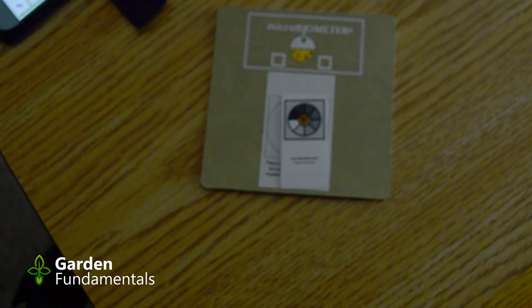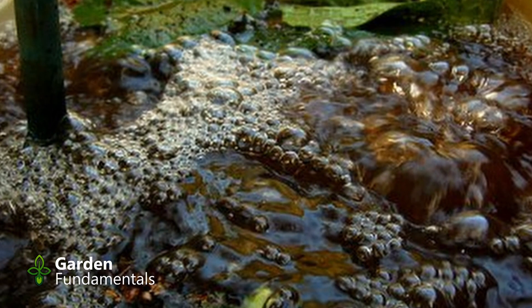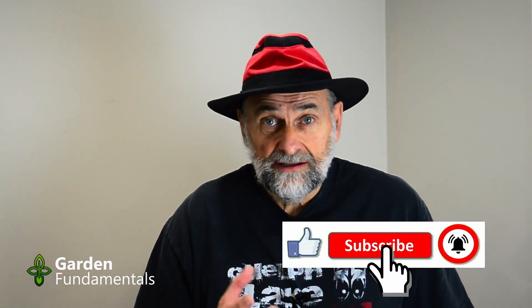I've shown you how to use the test to measure soil samples, but the exact same procedure is used for measuring compost. If you make compost tea and you want to measure that, you follow almost the same procedure, but instead of using the water you use your compost tea — and of course you wouldn't add a soil sample to that mixture. The app also has different types of tests, so you can select between compost tea, compost, and soil, and those will give you slightly different numbers depending on what you're looking for. Soil and compost results are reported as mass per gram, whereas compost tea is reported as mass per milliliter. Other than that, the tests are the same.